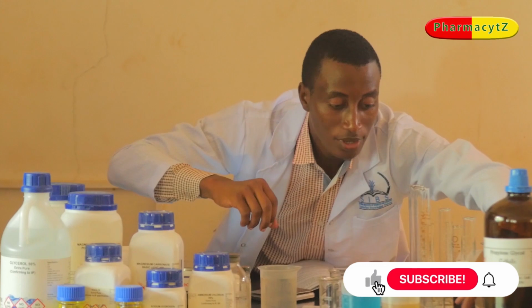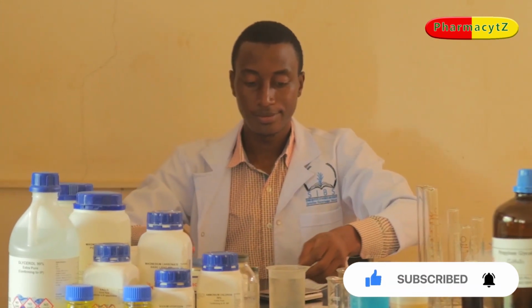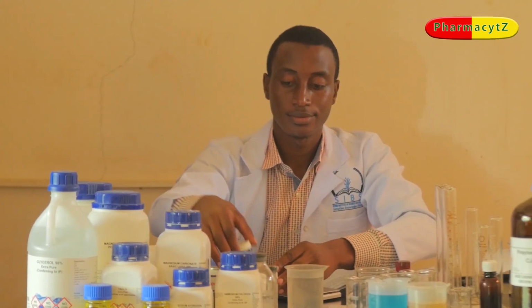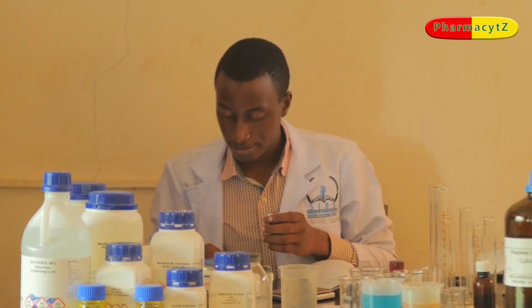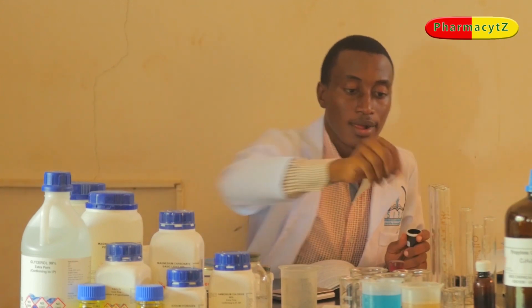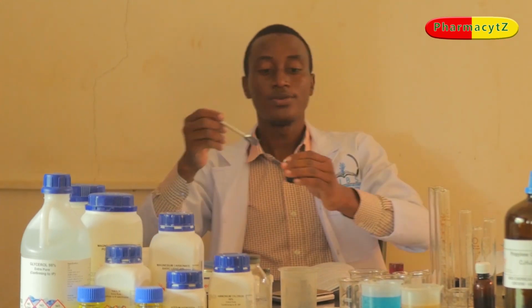Potassium iodide, 2 grams. This is potassium iodide. It can be scooped by using a spatula.